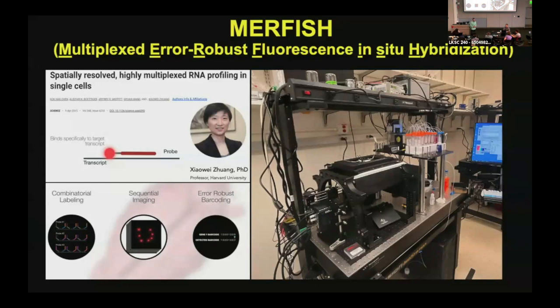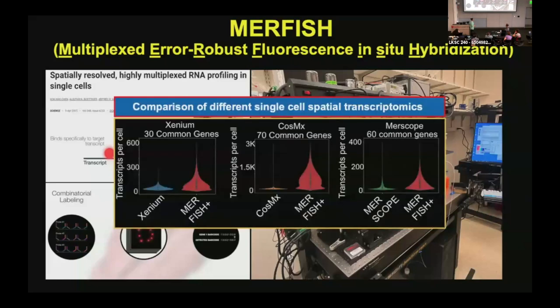And luckily at that time, Professor Bogdan Bintu had joined UCSD, so he's 2 stairs behind us, and he helped us to build this custom-made MERFISH scope that is very similar to the Vizgen one that you probably all know, but is custom-made. It's not as pretty as Vizgen, I would say, but we think that it is doing a better job. So when we calculate the transcripts per cell and compare our custom approach to all other commercial approaches, including Xenium, CosMx, and MERSCOPE, we see 10 times better transcript resolution.